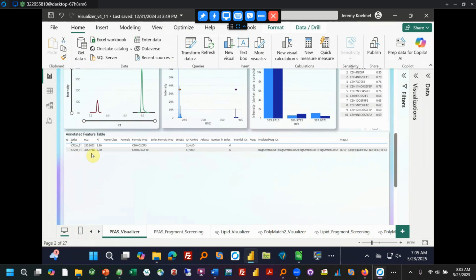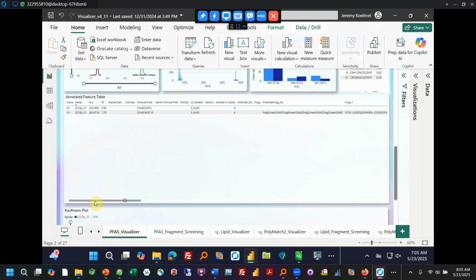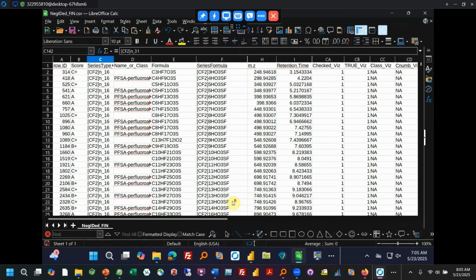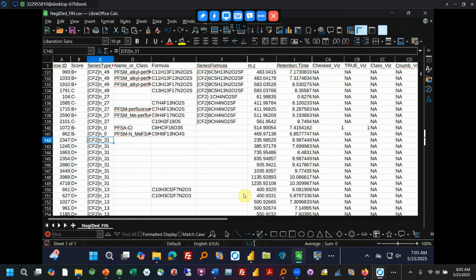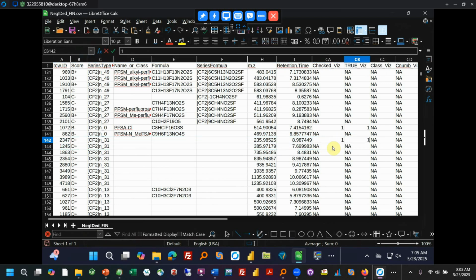And then we can scroll to the left over here. 2, 3, 4, 7, and 1, 2, 4, 5. So again, scroll all the way down because we start with some D's, just to show you how to do that. And 1, 2, 4, 5. So it was just these first two, right? We can double check that.